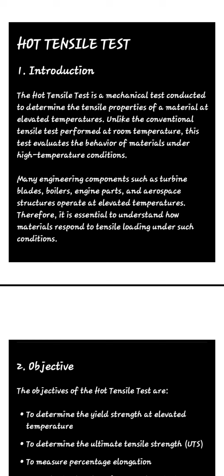Introduction. The hot tensile test is a mechanical test conducted to determine the tensile properties of a material at temperature. Unlike conventional tensile tests performed at room temperature, this test examines the behavior of material under high temperature conditions.